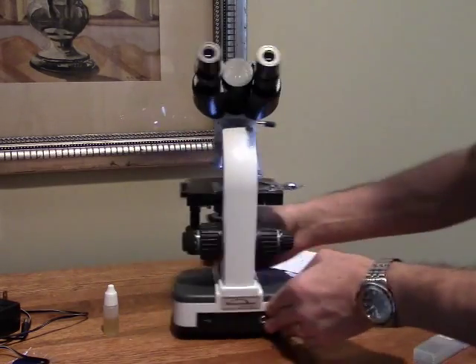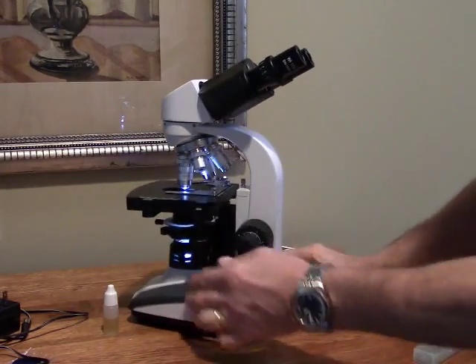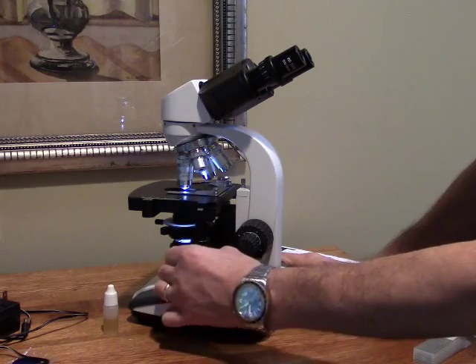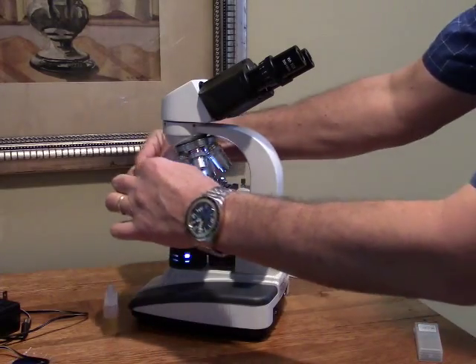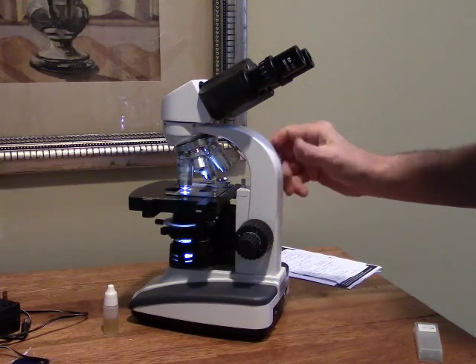This has a nice large stage with a drop-down XY control for moving your slide around, and it also has a very nice spring-loaded slide clamp to hold your slide securely in place.